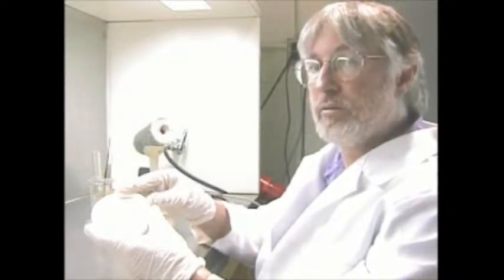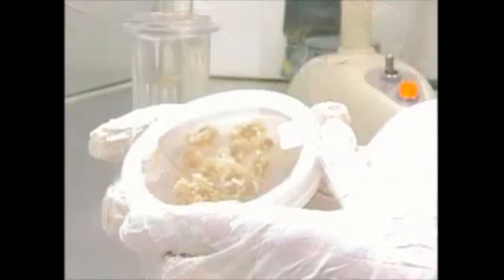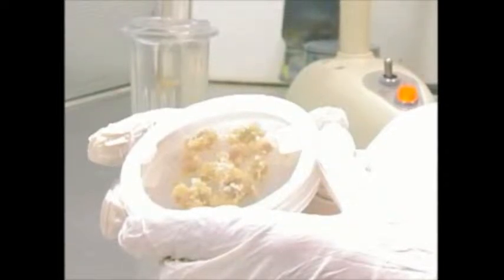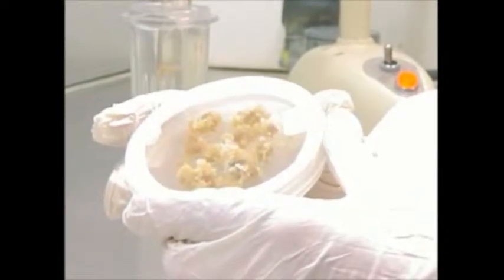The thing is, they do not have a regular seed coat like a typical sexual seed does, so they have to be handled very, very gingerly. There's a procedure for getting them to germinate in culture and then finally acclimatizing them so we can get them out of culture. So let's go back to the culture room now, where we grow these plants on under artificial lights.